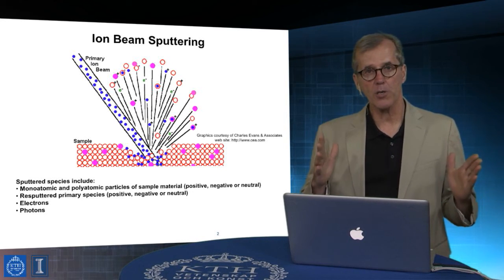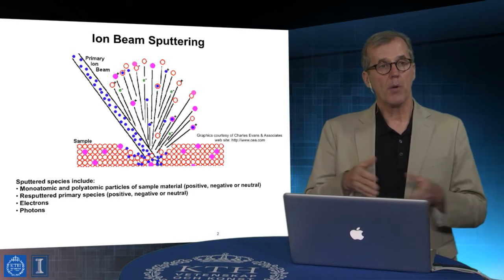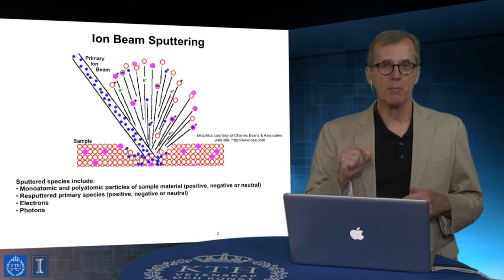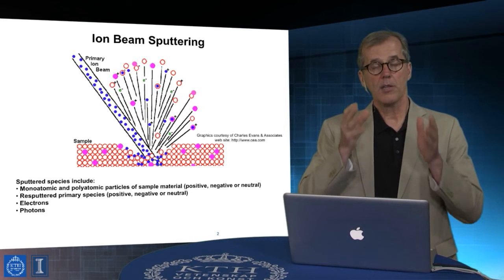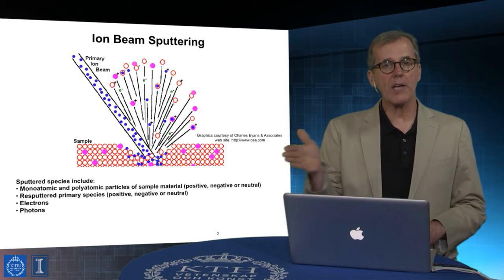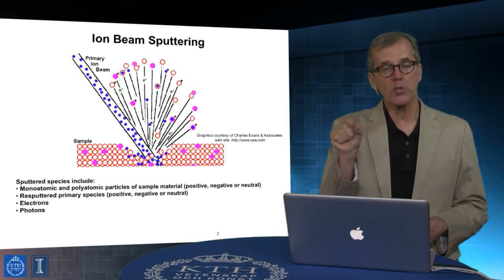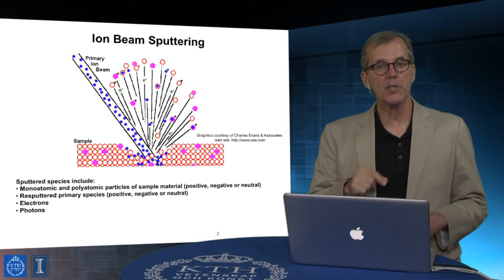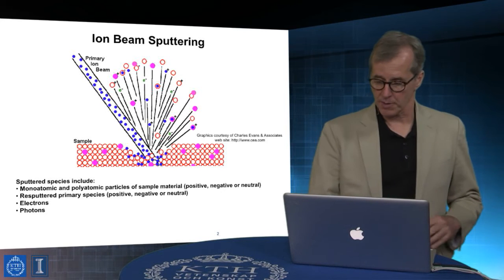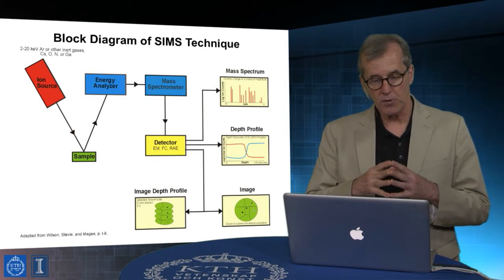Anytime you're working with charged particles, it is in principle possible to envision this as being both a small area analytical possibility, but also an imaging possibility, because what we can always do is take the charged particle, define a beam of it, and then use electric fields as a way of rastering the beam, and then we can look at this as both a small area analysis, but also a large area imaging-based analysis, much in the same way as what we saw with the use of electrons in the context of Auger electron spectroscopy, right?